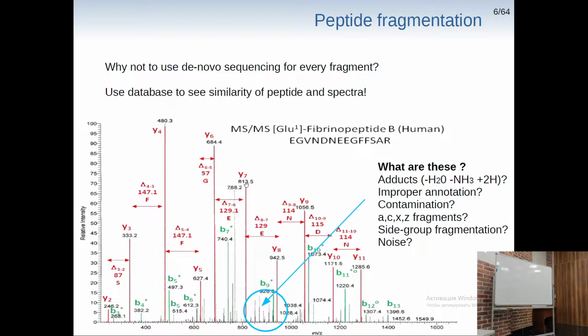It is not easy to search because we have 3 reading frames on a plus direction, 3 reading frames on a minus direction, right? But it is still possible to use this information. Of course, I will be talking about a database which is manually created in protein form, so-called SwissProt, which is quite usable, and I do recommend using it in the first place.